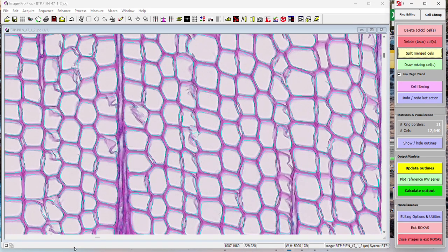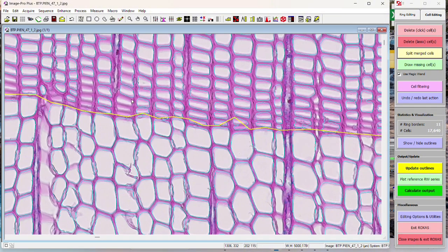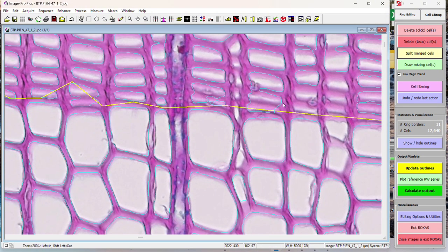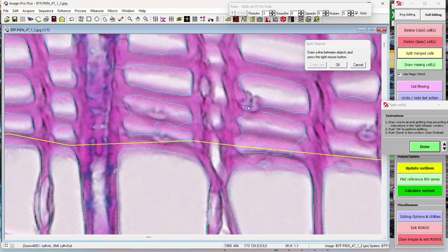And you can see it's making the measurements down here, and it looks like it was good. We can go back up and check them just to be safe. Ha! It did not do that. So I pressed done and then OK. That is the order I did that in, and it did not work. So we're going to try this again.